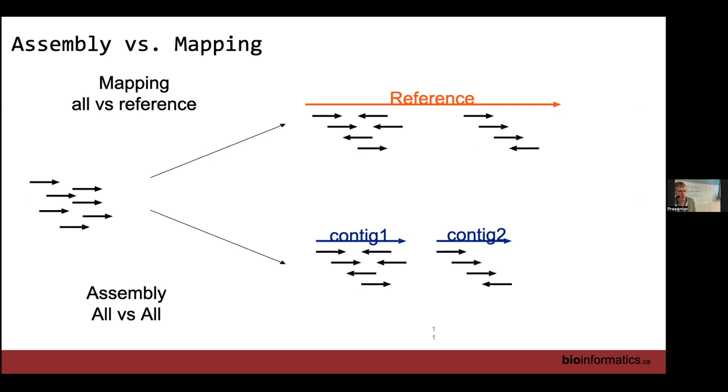I'll just mention here, with the work we're doing, we're taking mapping approaches. There are other approaches to working with sequencing data. Instead of mapping to a reference, you just do an assembly. You take all the small reads that you got and look at the overlap between them, and you build up a genome. That's complicated with short reads. It can be done, and a lot of local assembly work is done with some of the tools. But if you're trying to assemble a full genome, you really need a combination of short reads and long reads, which we're not doing with the Illumina technology.